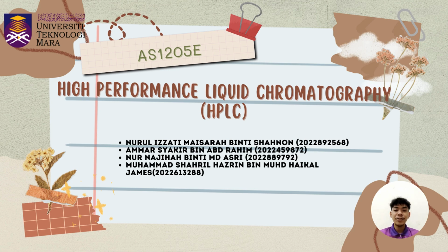We are excited to present our work on high performance liquid chromatography, or HPLC, a powerful analytical technique widely used for separating, identifying and quantifying components of complex mixtures. We will explain in greater detail about the analysis of sugar using HPLC.